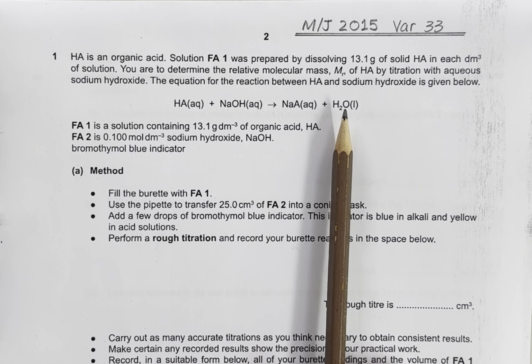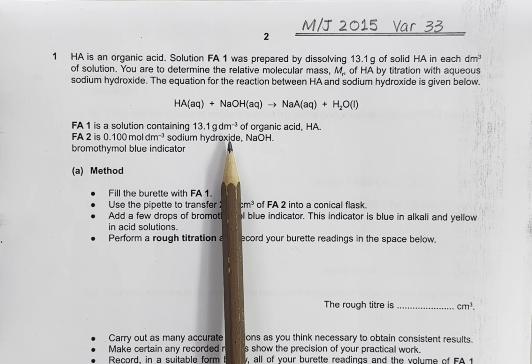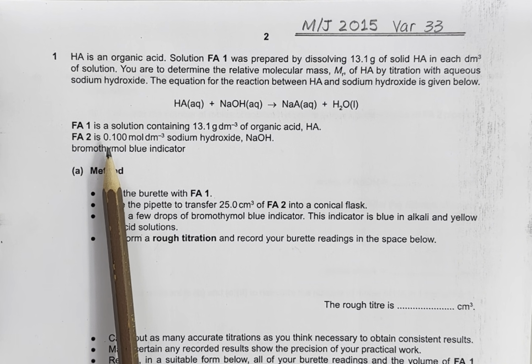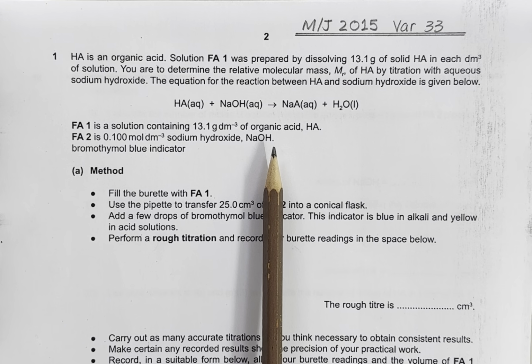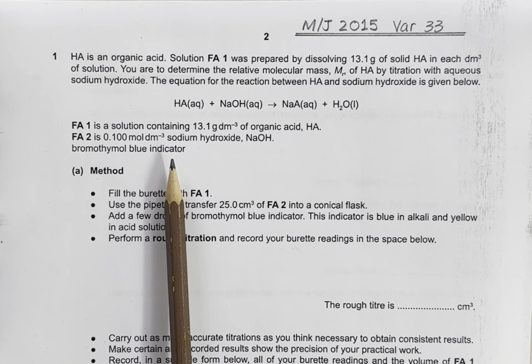So here is the equation. FA1 is a solution containing 13.1 grams per dm cube of organic acid, as they have said in the introduction. FA2 is 0.1 molar sodium hydroxide solution. In this case, we have bromothymol blue as indicator given.